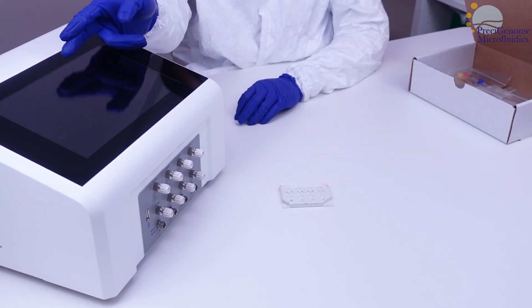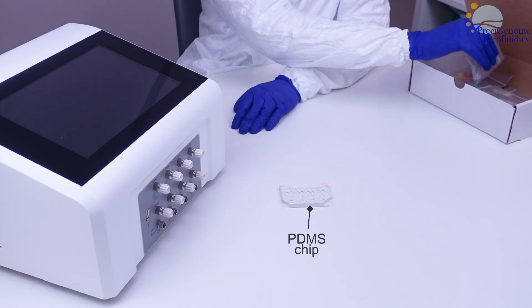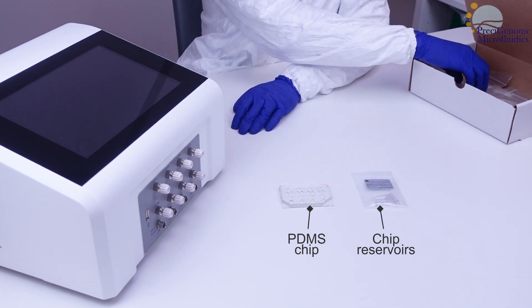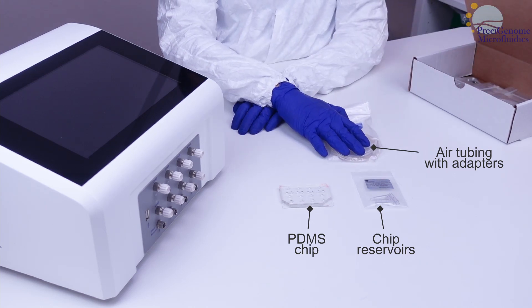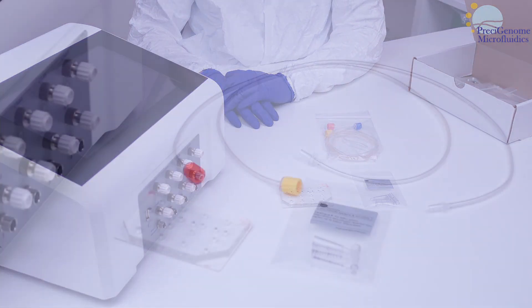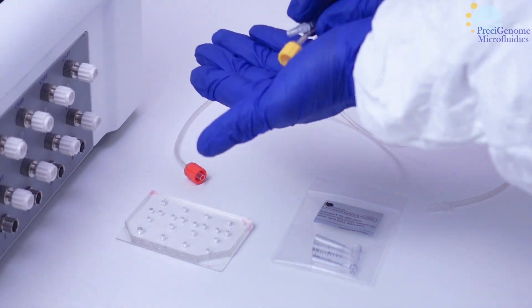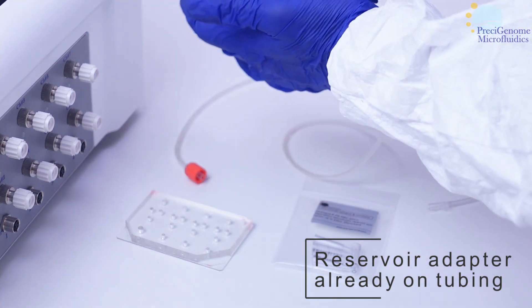In this video, we will show how to integrate a PDMS chip into your experimental setup. Aside from the chip itself, you will need chip reservoirs and Tigon tubing with adapters. The Tigon tubing in this kit will already have the appropriate adapters, so you can plug them straight into the reservoirs.